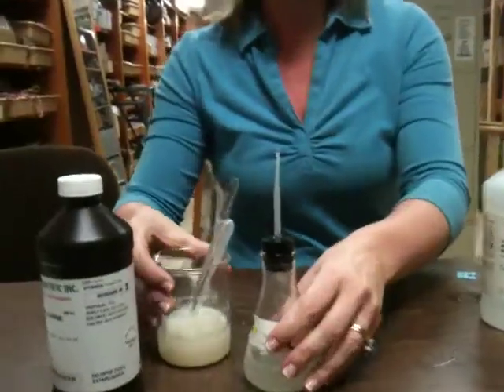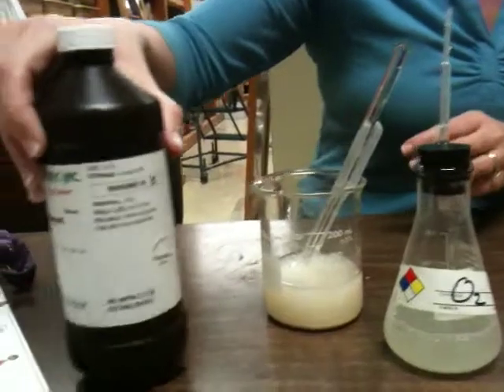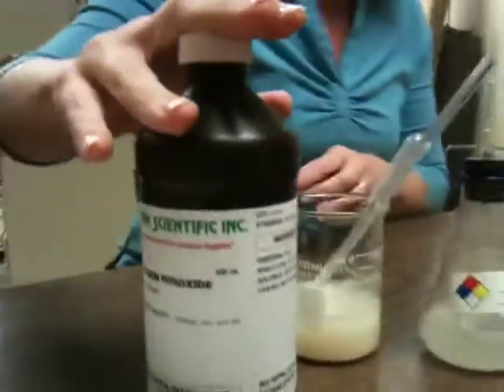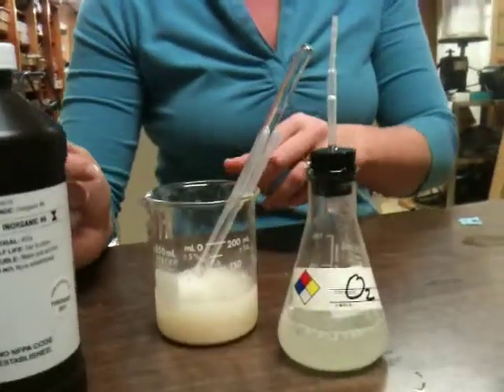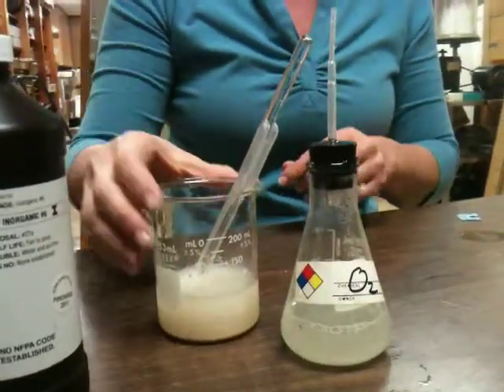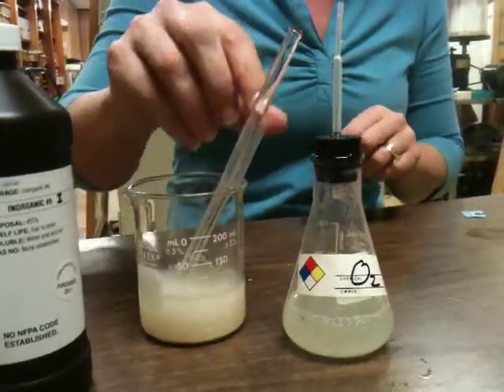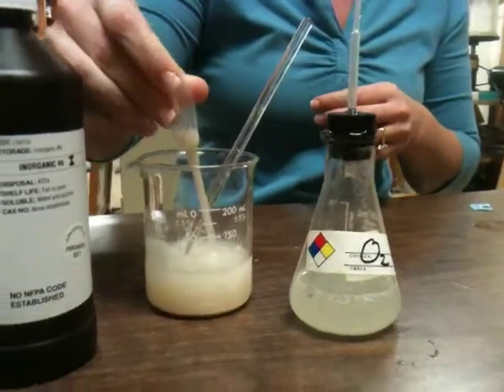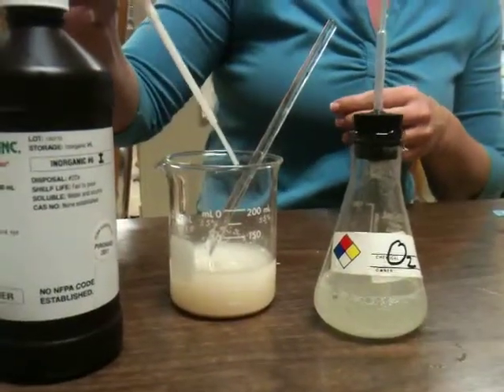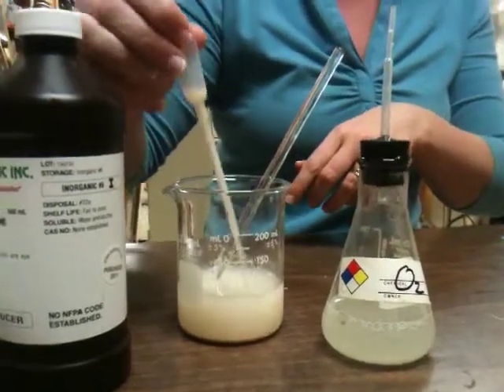When you collect your oxygen, you're going to use your oxygen generator. You're going to use the peroxide, just like we did before. It's 6% again. And this time, instead of potassium iodide, we're using yeast as our catalyst. And so it's this milky, yellowish liquid that's in a beaker. It says you need 2 milliliters, but if you just take your pipette, get a full amount pulled up into it and squirt that in, you should be fine.